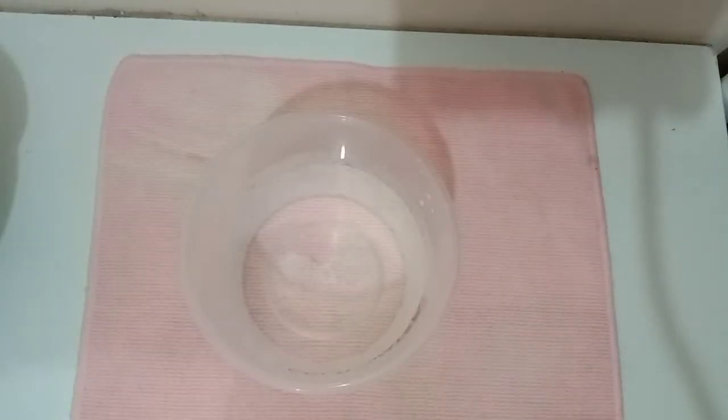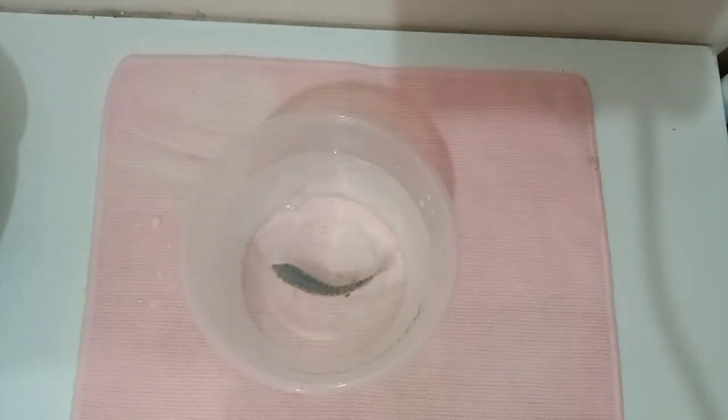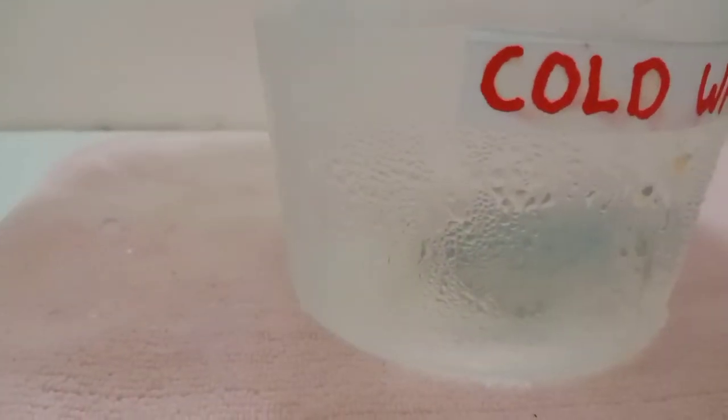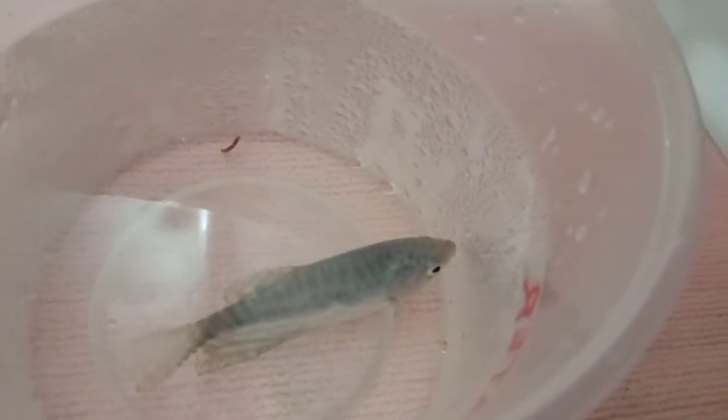The next step is we put the fish in the beaker that contains 200 ml of cold water. Observe and record the number of breaths every minute by counting the number of times the fish opens and closes its mouth.